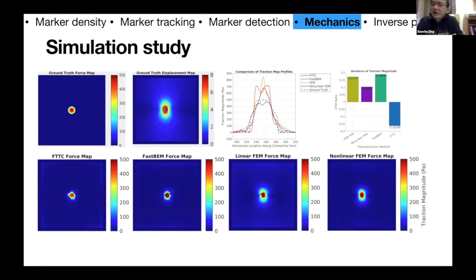So if it's not a gel, like a larger-span scaffold attached on the gel surface, and then we examine the cell size or growth morphologies in response to the forces, do you think it's possible, if that scaffold is very thin, that it can still be observed with your microscopy?